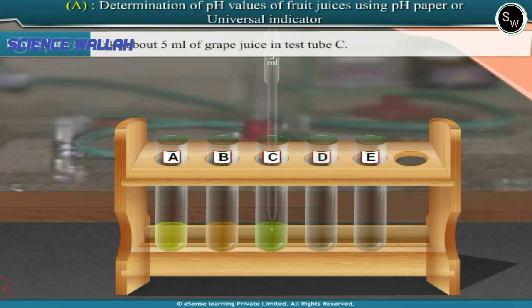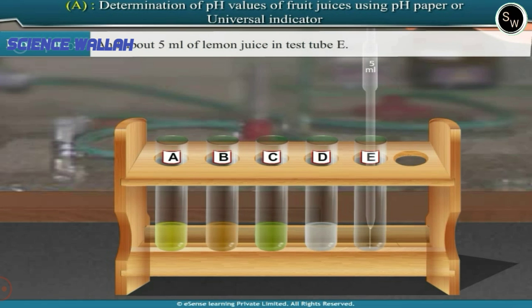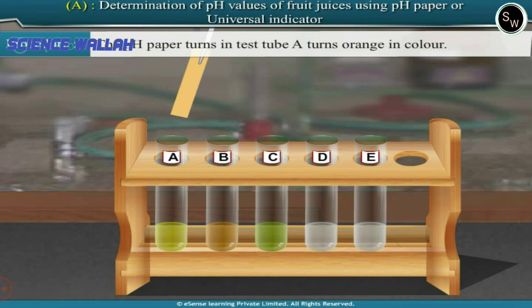Take about 5 ml of grape juice in test tube C. Take about 5 ml of sweet lemon juice in test tube D. Dip small strips of pH paper into each of the test tubes A to E. Observe the color developed on the pH paper and note down the color in the observation table.